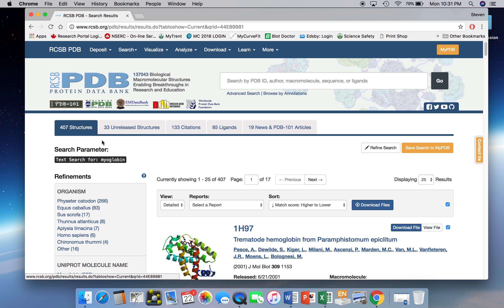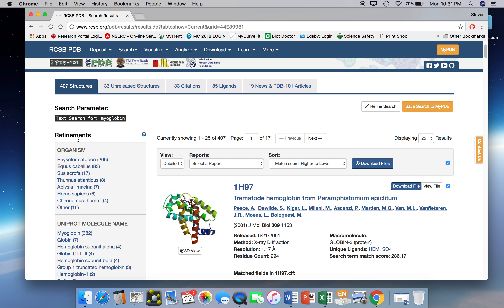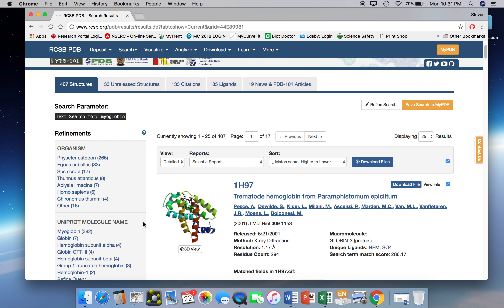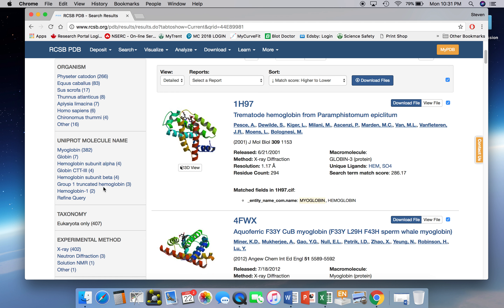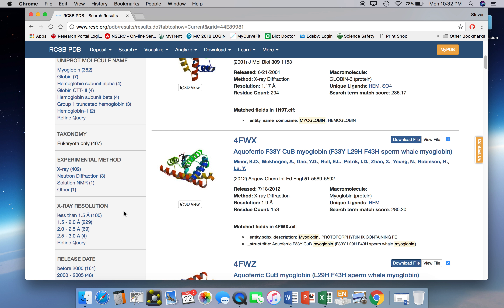That explains, for example, that many of these structures occur from different organisms as shown in the top left here. If you look at the sidebar where it says refinements, this shows you how the different structures are slotted. Some of them come from different species, and some of them have different UniProt molecule names. Some are solved by different experimental methods — X-ray crystallography is the major method for solving structures now, but NMR is also a commonly used method. Another technique called cryo-electron microscopy will probably be the way of the future for subsequent structures.